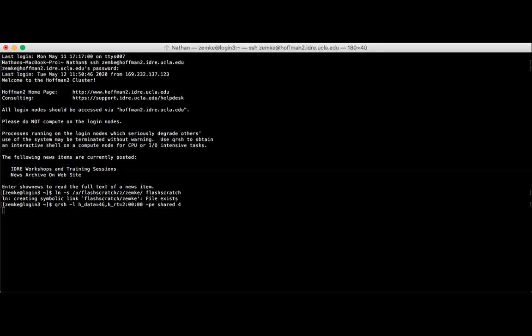Okay. So again, any text in red, you need to replace to match your specific username.